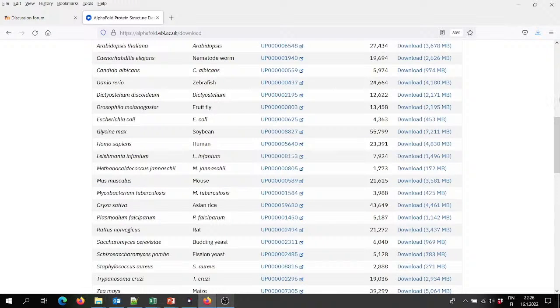So let's take a look at the AlphaFold database site. First, this is the list of the 21 proteomes they have. It's human and 20 other model organisms: 4 plants, a couple of prominent animal models like zebrafish, fruit fly, C. elegans, some medically important parasites, some medically interesting bacteria, and E. coli, the obvious model organism. So they have all their proteins, as far as AlphaFold could model them, presented here. And then we have the SwissProt dataset, which is another 400,000, so really mind-boggling there.